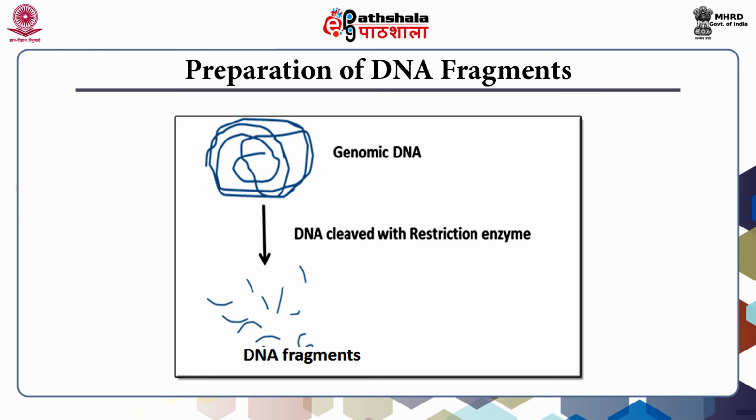For selection of restriction enzymes to be used, it is required to know the restriction sites present nearby the gene of interest. A specific gene can contain a number of restriction sites, and cleavage of the gene with a particular enzyme produces a fixed number of fragments of fixed size. Mutation, deletion, and rearrangement in a particular gene of interest may alter the number or the size of restriction fragments generated from enzymatic cleavage.